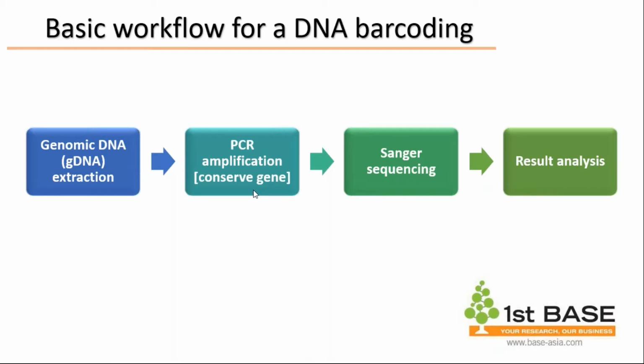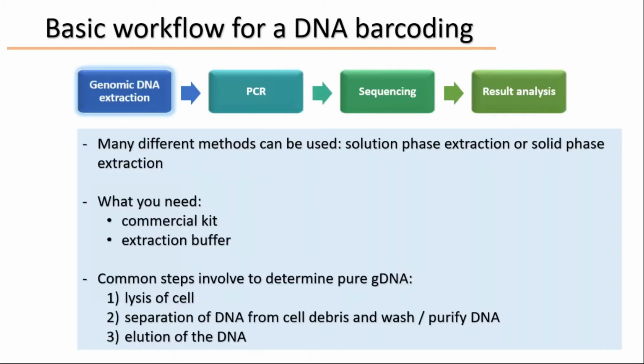After PCR, you perform sequencing to get the sequence of the conserved gene, and then it goes into result analysis.